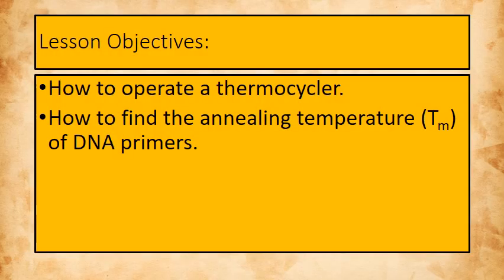Now the objectives for our talk today, I want to keep brief. One is how to operate a thermocycler. A thermocycler is a pretty intimidating piece of equipment. It's incredibly expensive, it weighs about half a ton, and it's got all these buttons on it. So how do you really operate a thermocycler? And one of the things you need to know before you run a thermocycler is what settings you should set it at.